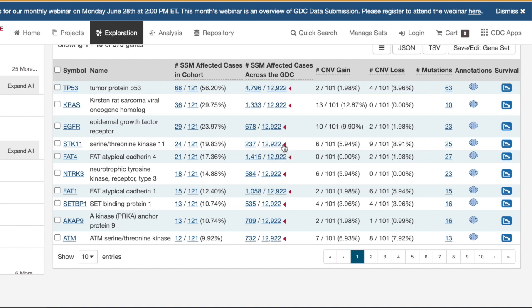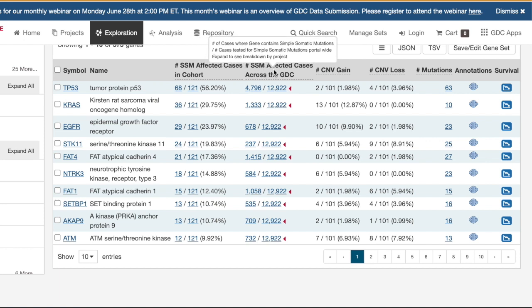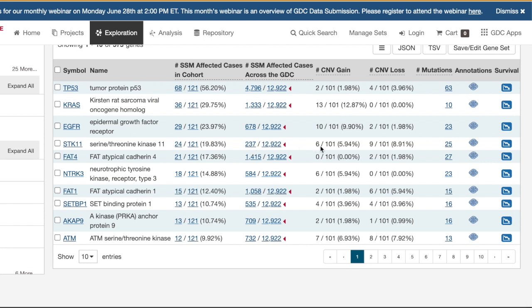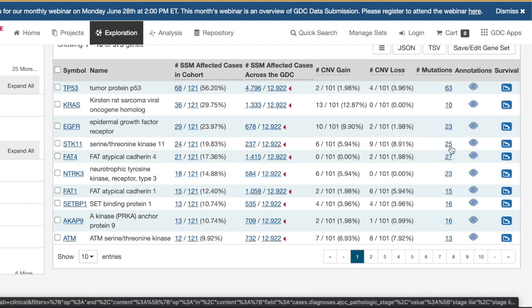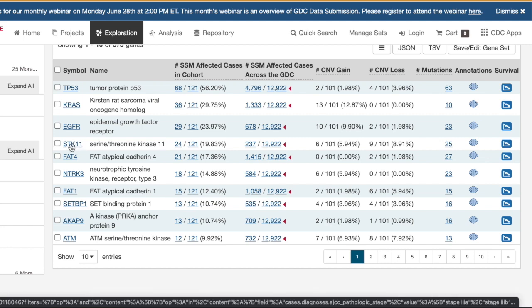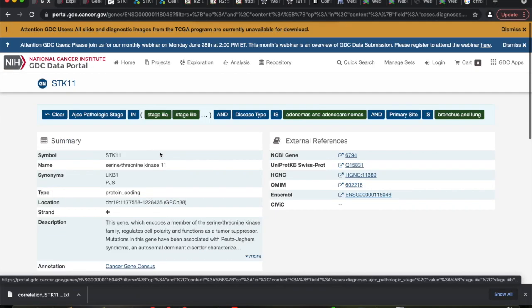We can get all this information — we can see it's affected across the entire portal, meaning it's mutated across all the cancers. In this particular cohort there were six times we saw a gain and nine times we saw a loss of this gene. There were 25 known different mutations for this gene. Click on STK11 itself and you should see this — but don't read the description yet.